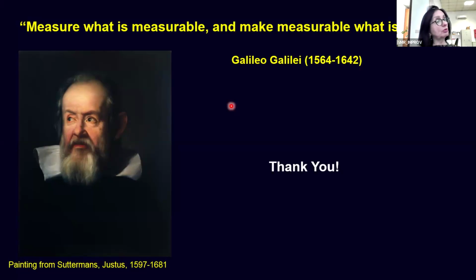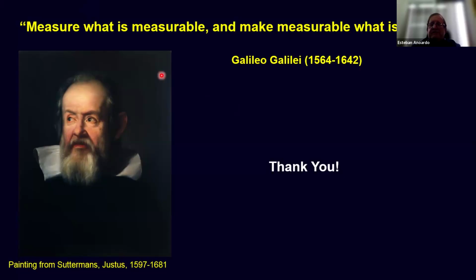So I do not know what you mean by validation of a model, because in this sense, models are never validated, because there is almost always a matter of debate what the system really does. Well, this is the point. The models, before you start to use them systematically, should be validated. And the way to validate it, you have two different ways to do it, at least.